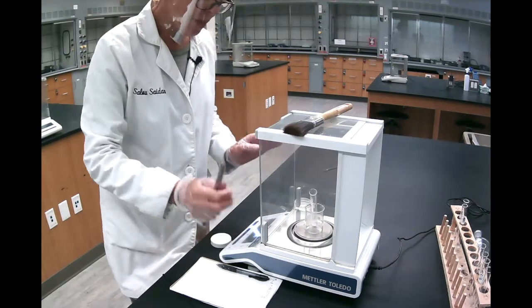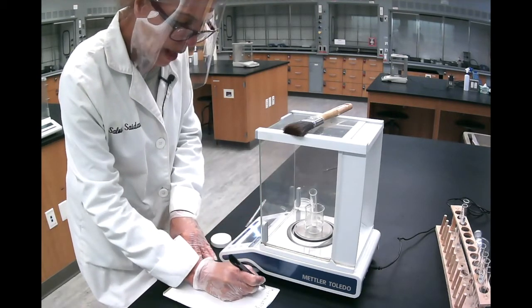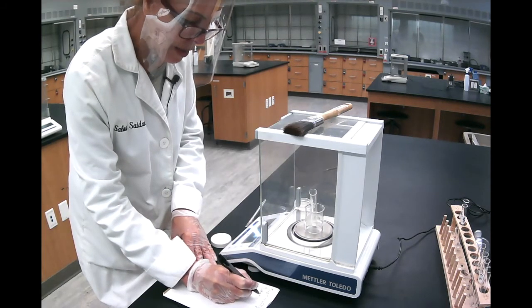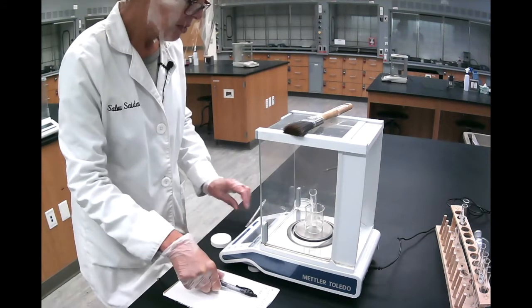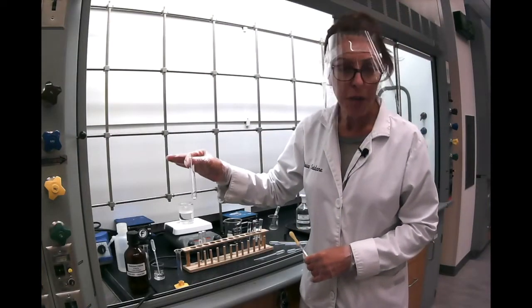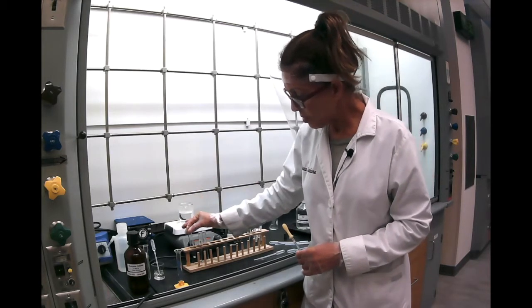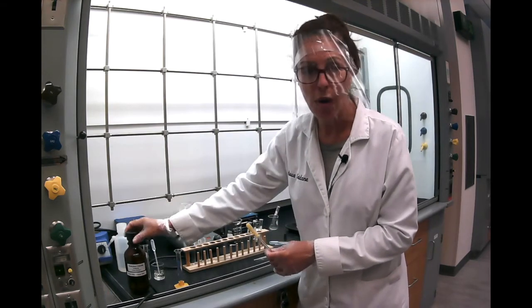So here's my final reading. It's the mass of tube plus beaker plus acid is 44.5611. So I went slightly over 100 milligrams, but that's okay. It's very close. So here's our 100 milligrams of benzoic acid, and what I'm going to do is add 2 milliliters of methylene chloride and 2 milliliters of water.